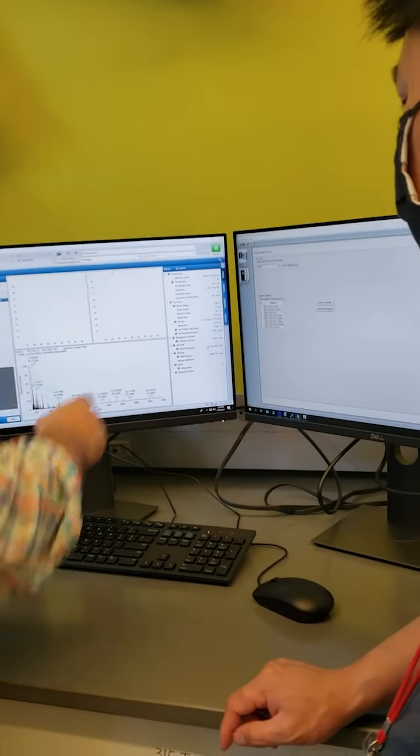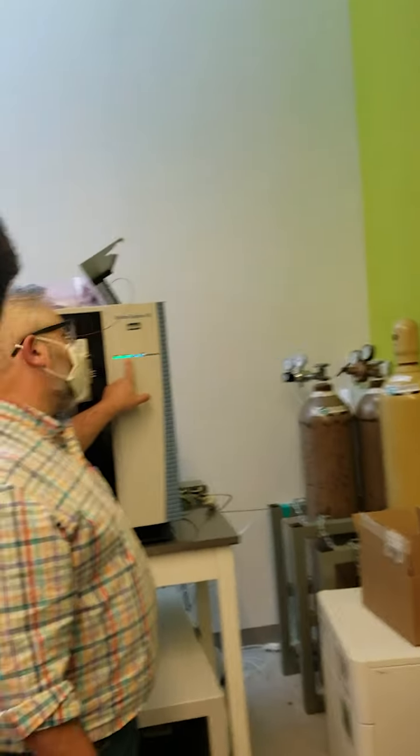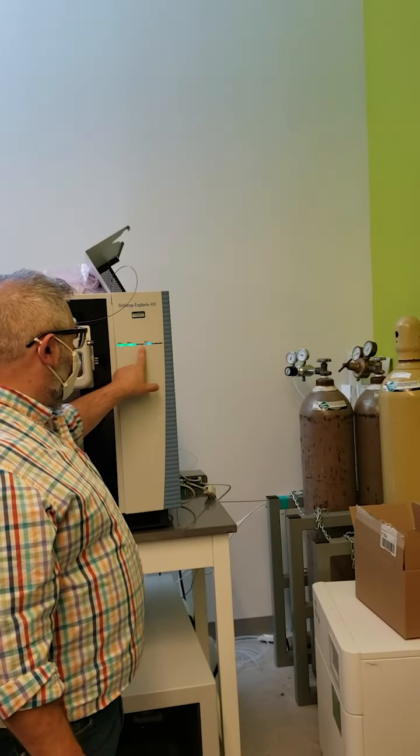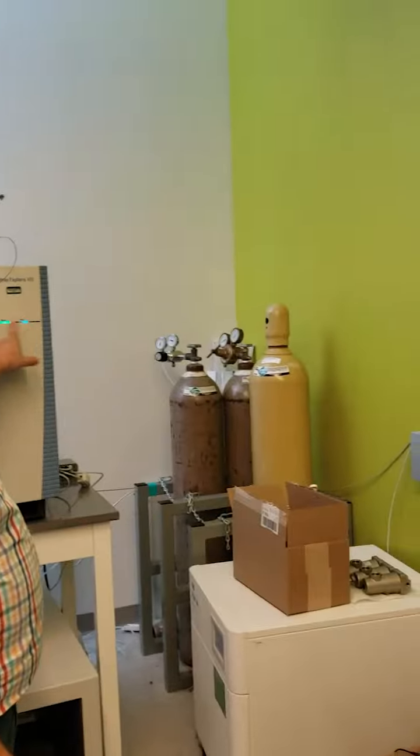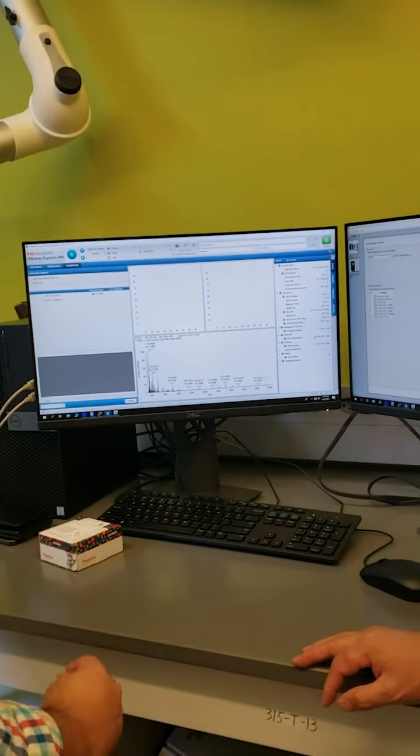So okay, good. Pressure's up. Power status means our pressures are good, and scanning it just means it's scanning. Yeah, it's always scanning. Yeah, that little thing looks like those old Christmas lights that make bubbles.